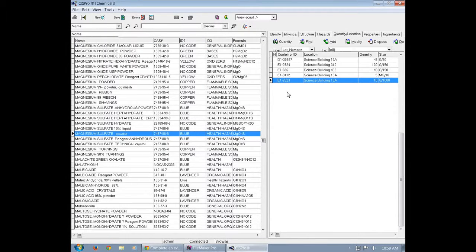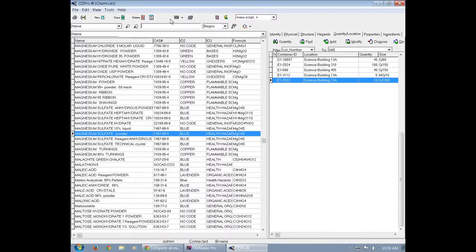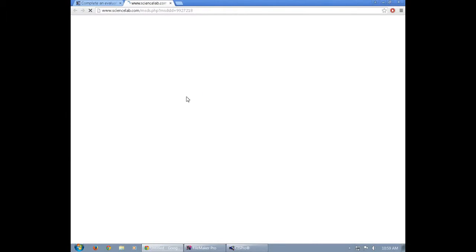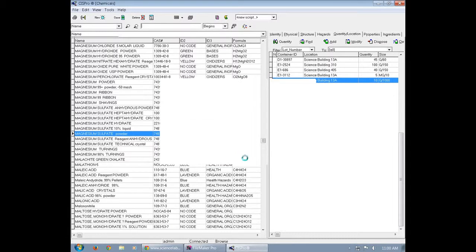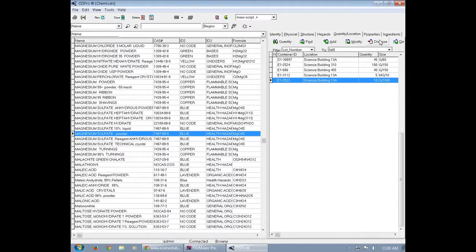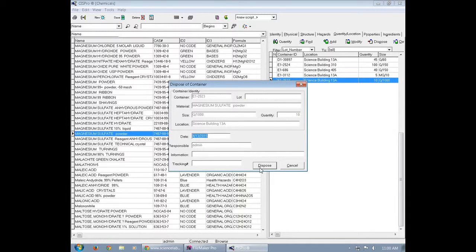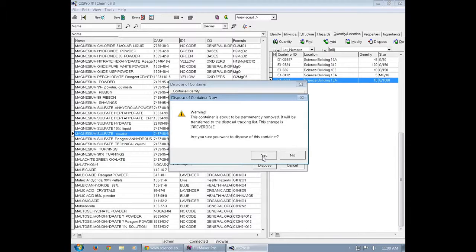you're going to open up the MSDS for it. This will be used later when you're filling out the yellow card because it holds all the information on the chemical. Now you can close that and while you're on the chemical, click dispose. Then make sure that the disposal date is correct and authorize it to be removed from the system.